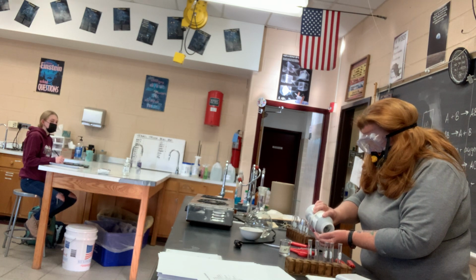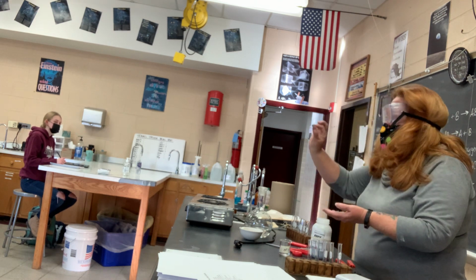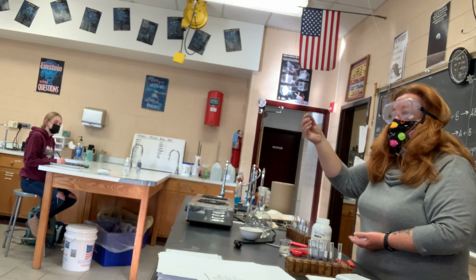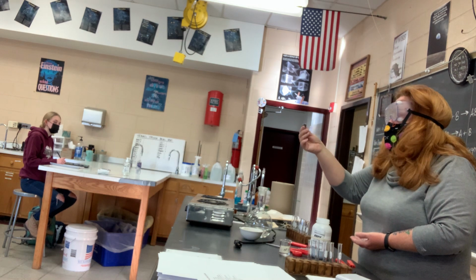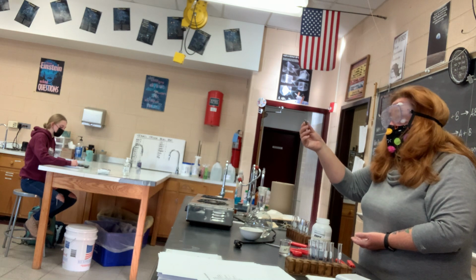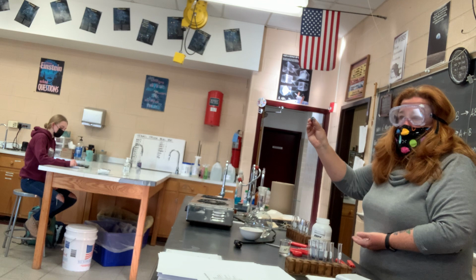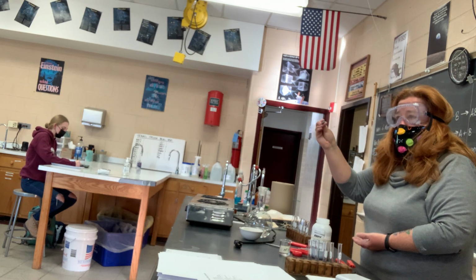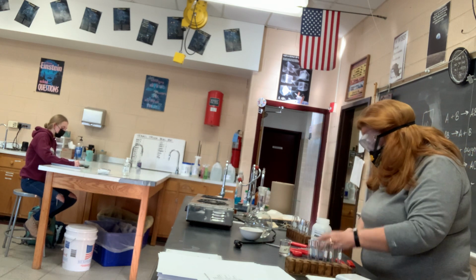It's not very caustic, which is why I can touch it. It's just a metal. If you can see a bigger piece, this is what zinc looks like. The way they make this is they make it molten and drop it into cold water, and it solidifies into weird shapes that look like moss on trees, and that's where the word mossy comes from. It's a silver-ish color, not very shiny, very solid, very hard. But that's what it looks like.